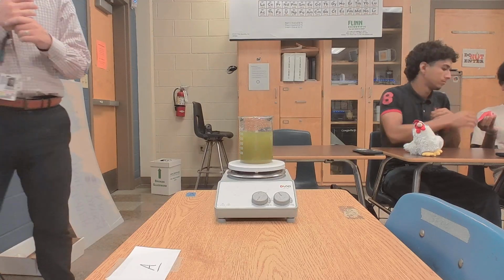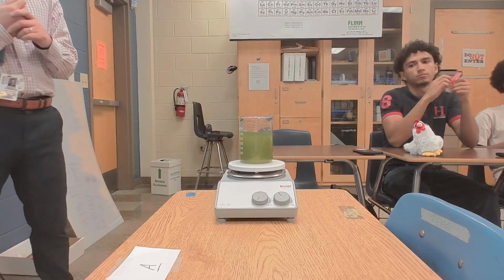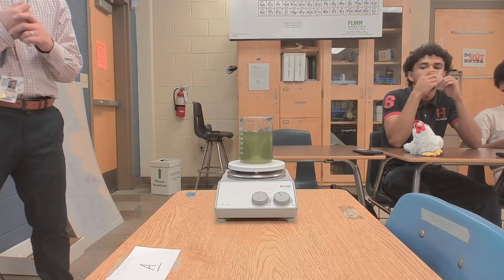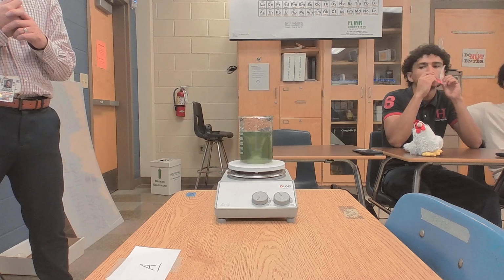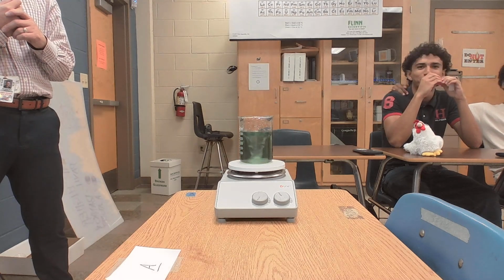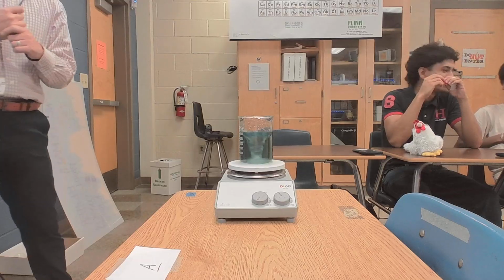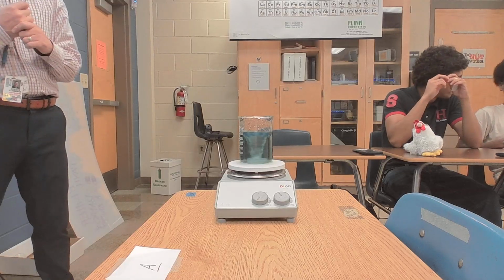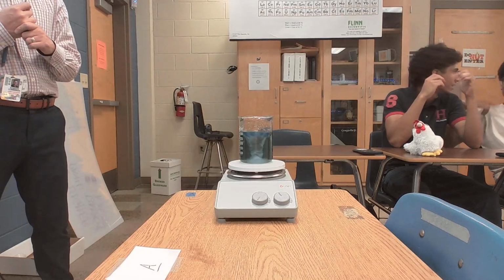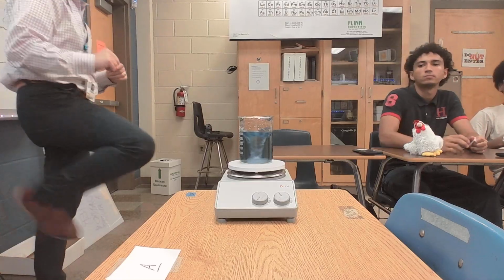But not only will it become less of an offensive green, it's going to clear up in a moment. You're going to be able to see straight through that solution. But then the kinetics are going to allow the green to go blue. And if you keep watching, you're going to get purple and red. So be patient with it.